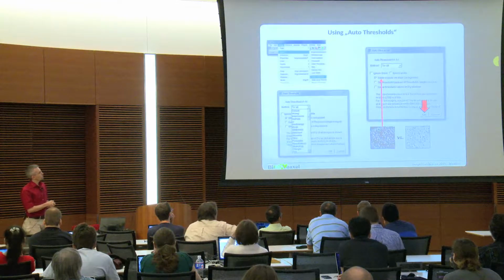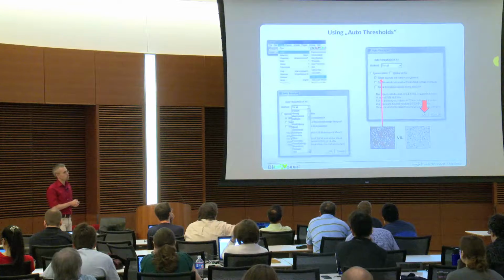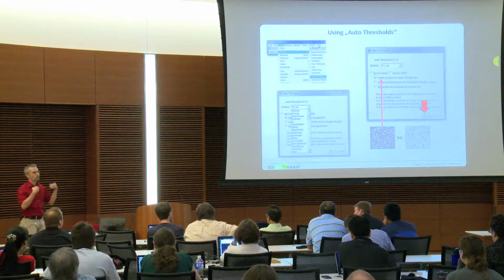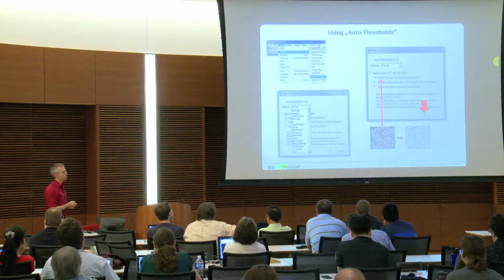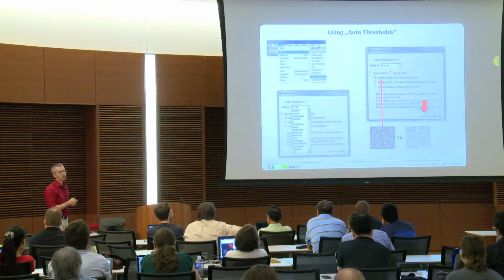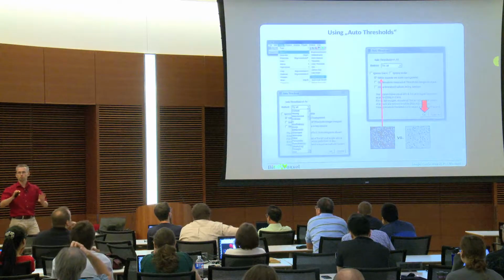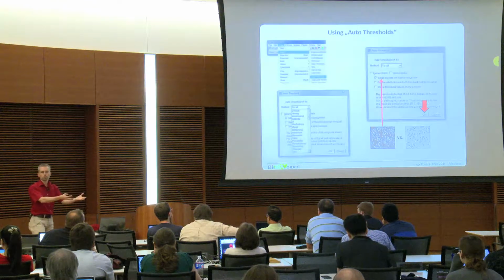Activate that here. Additionally, you have a function which says ignore black and whites. Normally, I always skip that in the beginning, and only if I can't find any good threshold, I try it again with one or both of those active. This means simply by defining the cutoff value, it ignores black pixels or white pixels or both, because they influence the histogram, so they also influence the cutoff value.